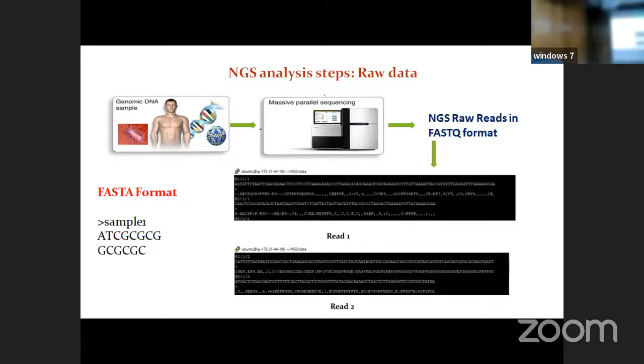One more thing I would like to tell: when you are performing transcriptome analysis, you might get 2 isoforms upregulated and 1 isoform downregulated. And when you merge everything and normalize everything, you might find no differences. Just coming back to your question, that also happens when you are doing practicals. So please never generalize in terms of gene.